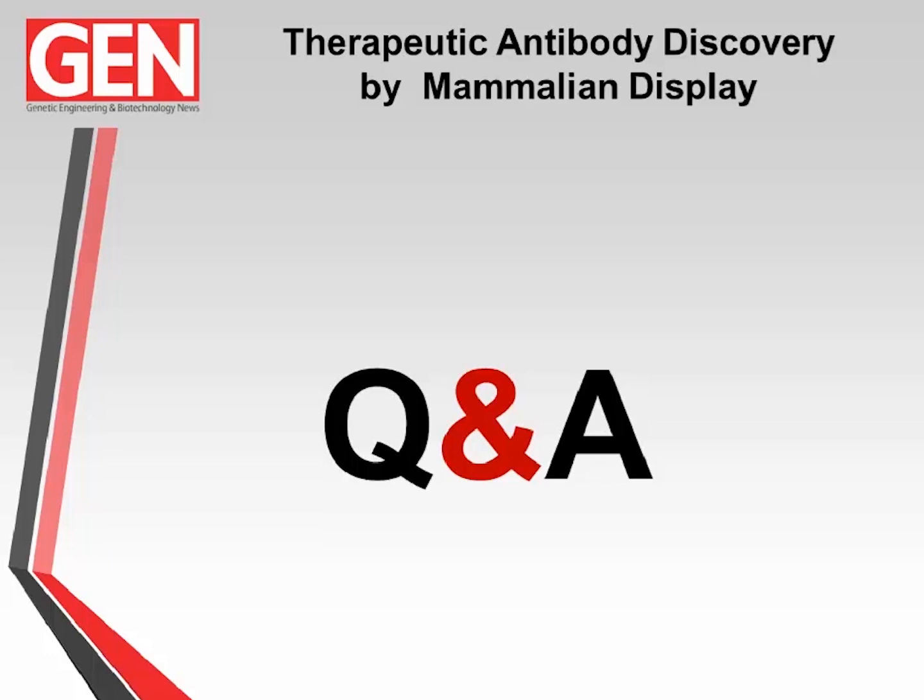I guess with phage display, powerful technique as it is, at the end of a discovery phase, we still have to reformat into IgG format, but of course that's the standard format we're using for mammalian display. On top of that, at the end of the mammalian display process, we will have screened millions of candidate antibodies rather than hundreds, so the depth of that screen is increased by 3 or 4 orders of magnitude.